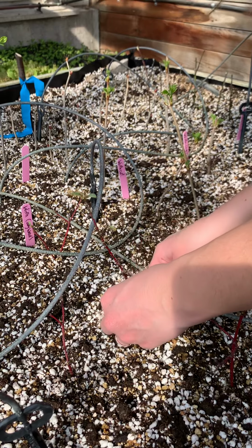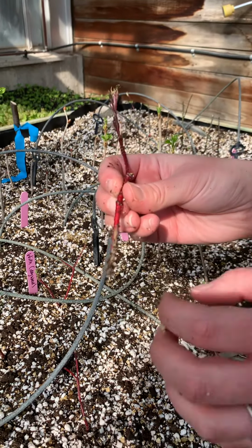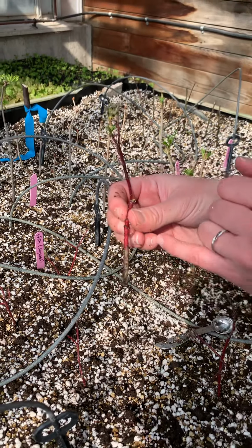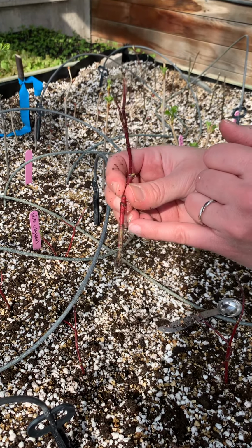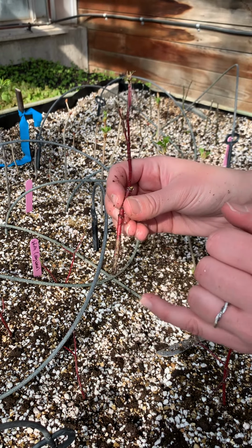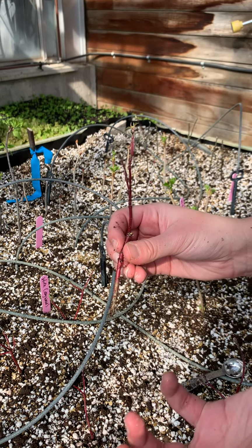I'm going to be very careful. All right. I thought this was a root, but I think it's just a strand off of the cut. So that's fine. So interesting to see that we don't really have the callus on number 2 that we did on number 1. We have roots starting. So right here is definitely a root starting. This would be up to the collector. If you labeled this roots, I would give you the marks for it. If you labeled this as no roots, I would give you the marks for that. It's so on the verge that, you know, is it fair to call it a root quite yet? And the answer to that is subjective.